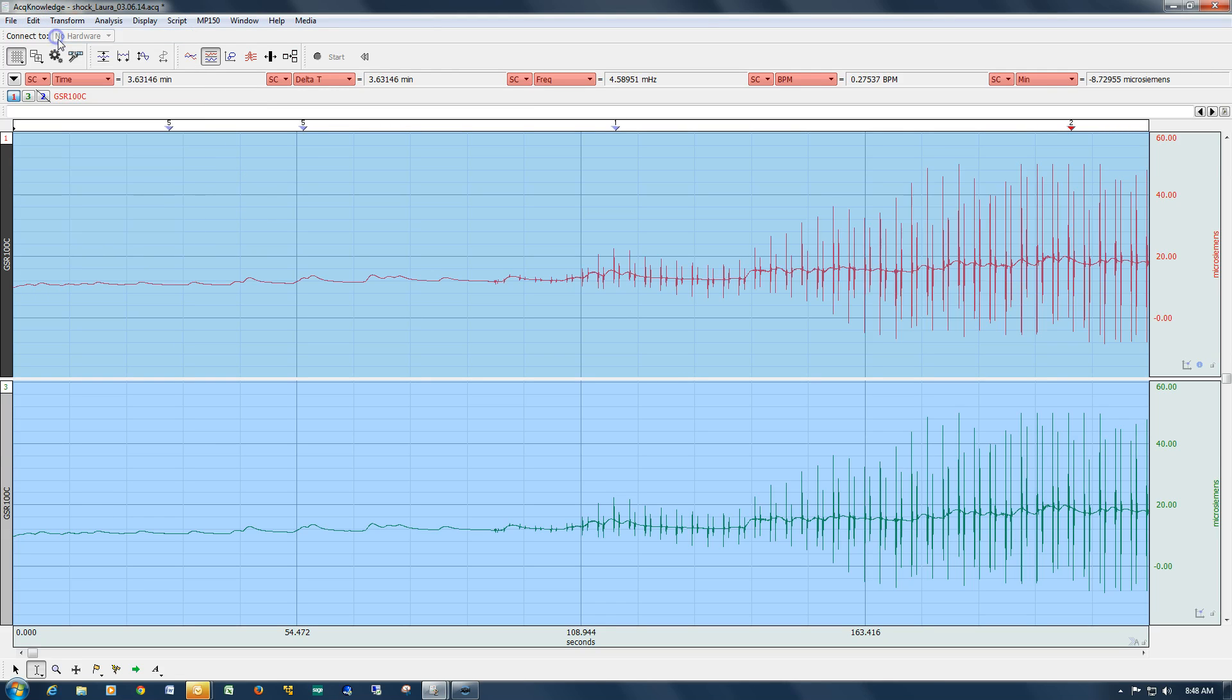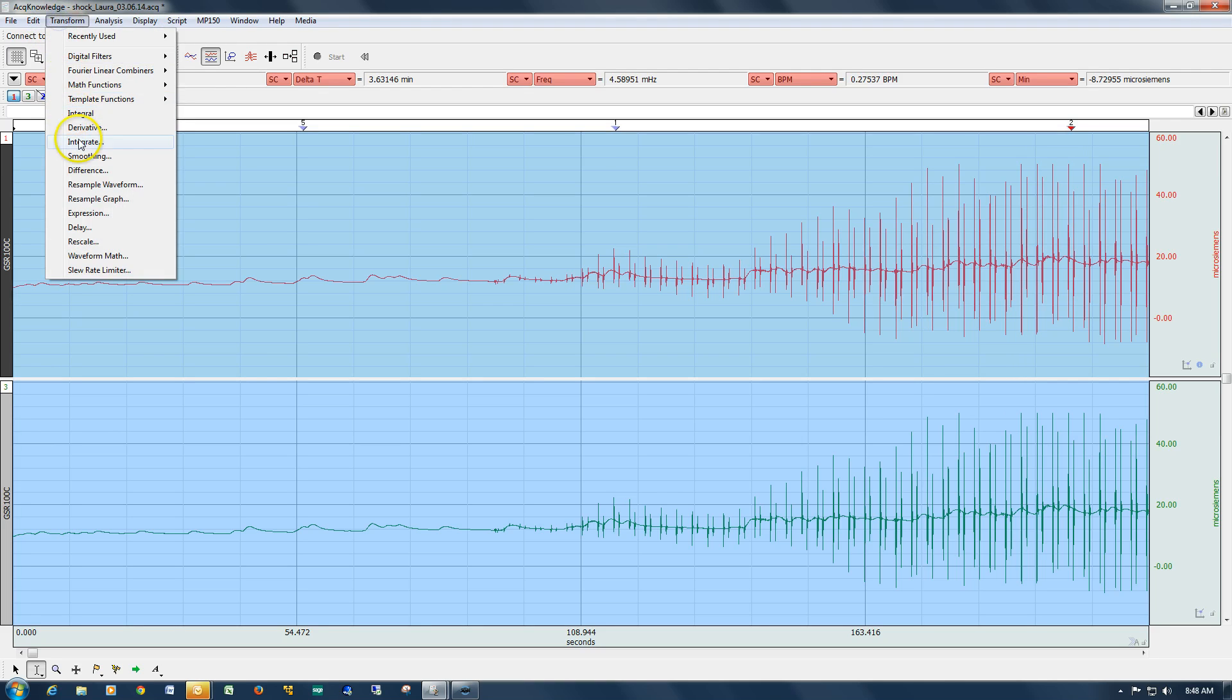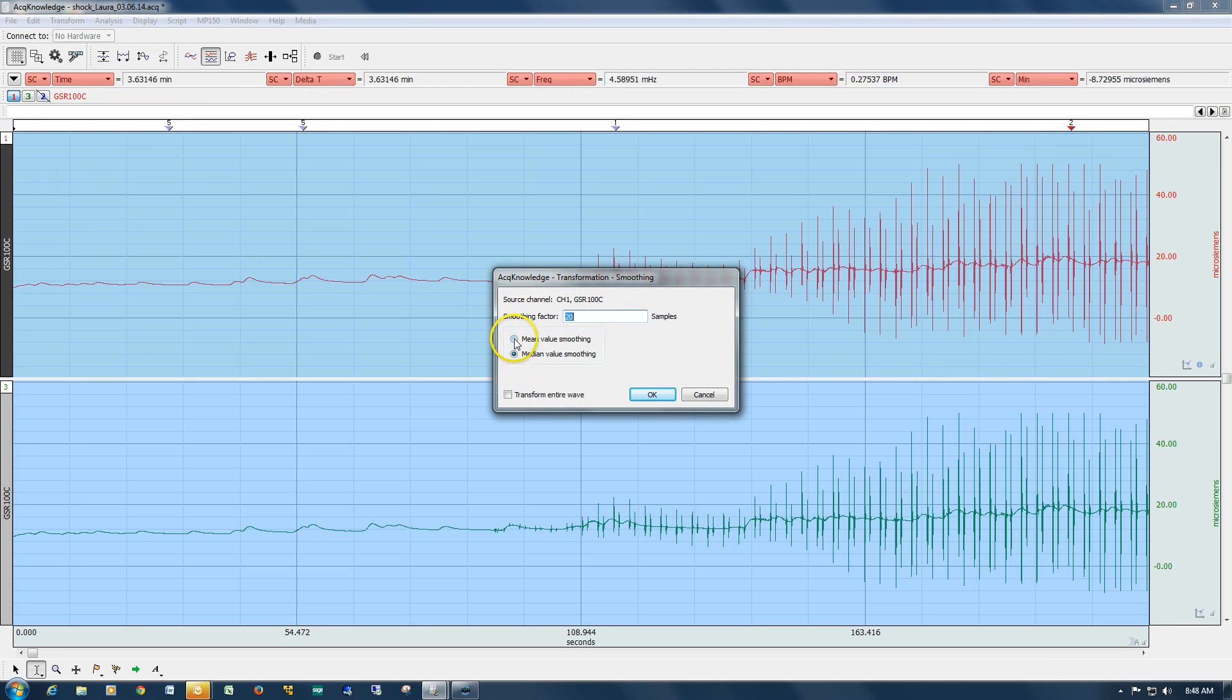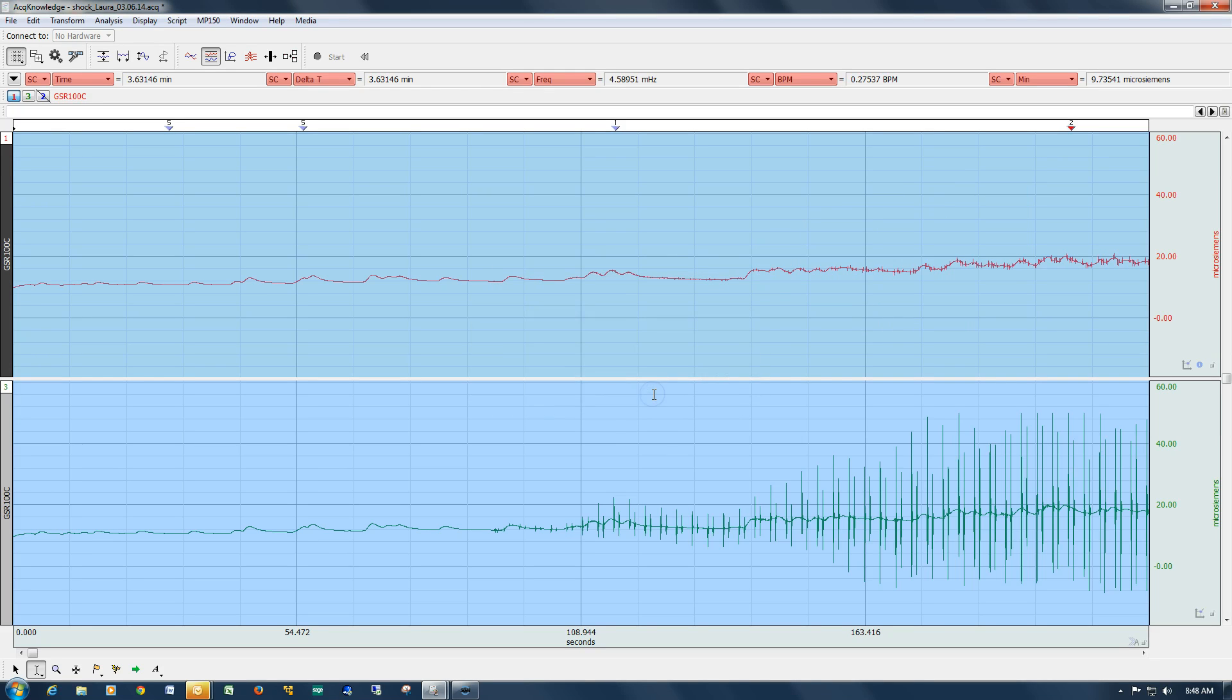Just to demonstrate this point a little further, if we go back into smoothing and we change this to mean smoothing, you can see we've still, at that same level, we've still got these spikes in there.